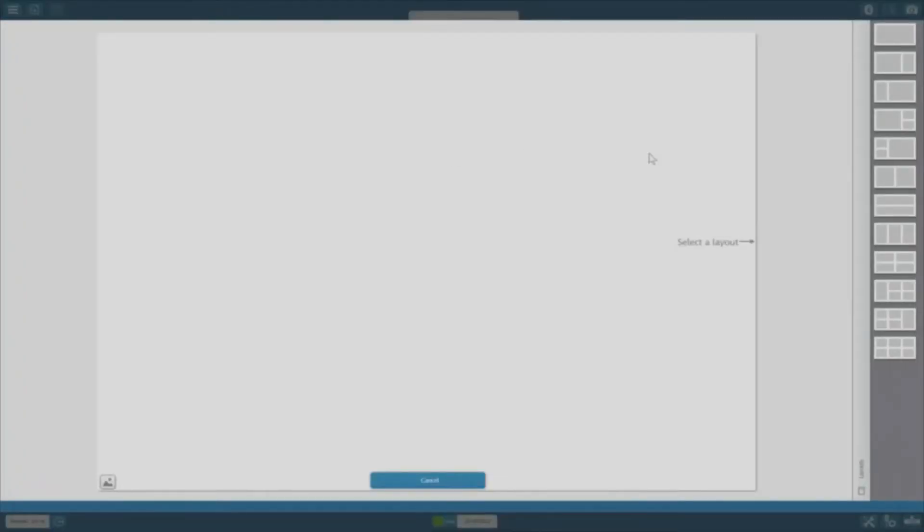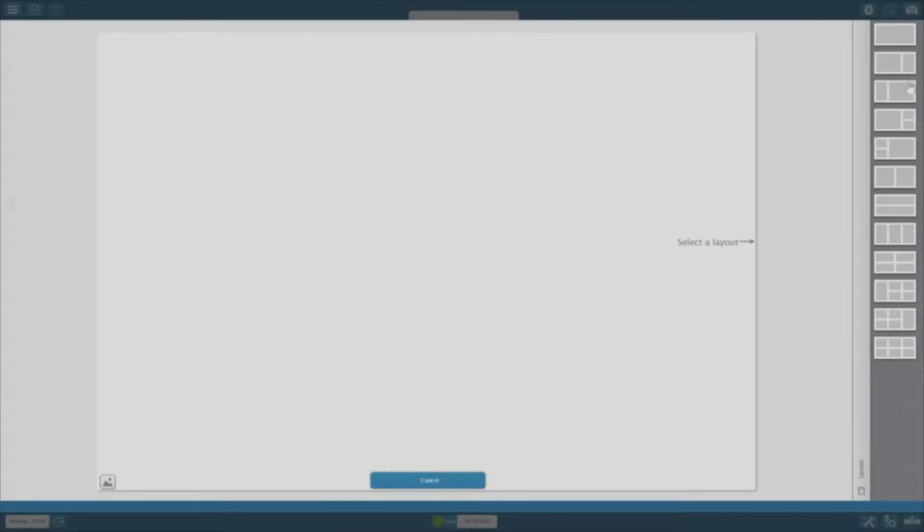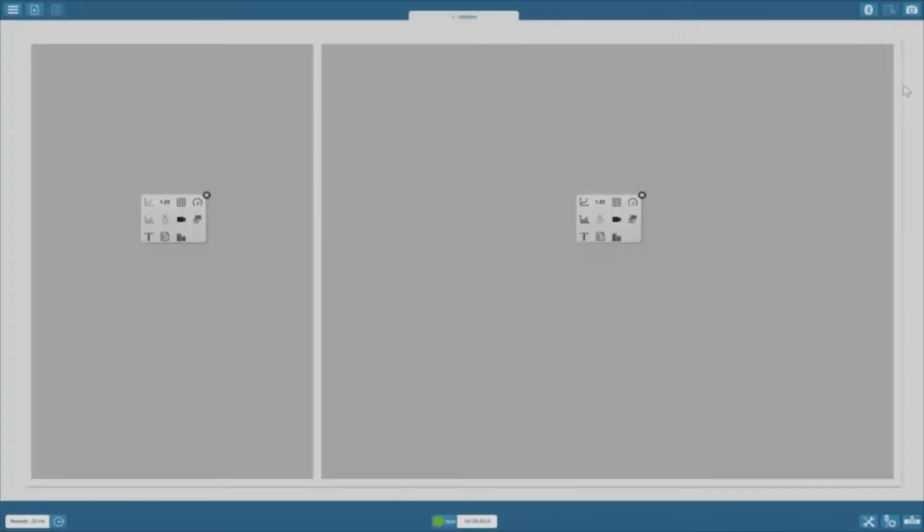Next, we're prompted to select a layout to display our data on the screen. For this class, we'll use the first three options. Today, I'll choose the third one, which gives me two panels.